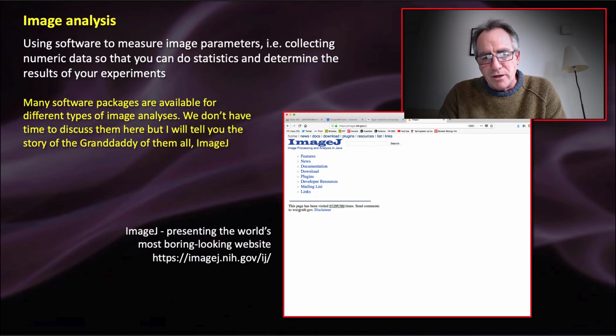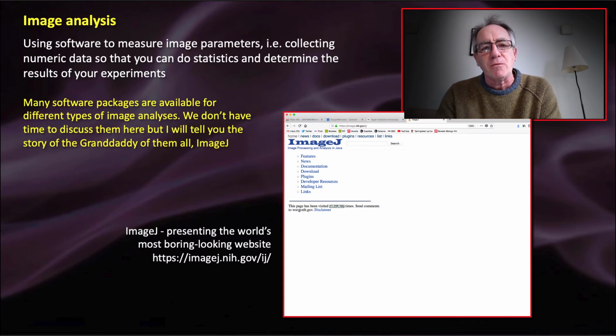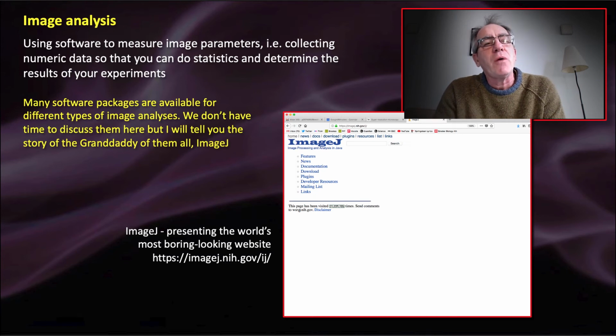The one thing that we've got to talk about when we talk about microscopy is image analysis. You can sit in your little dark room all day long making beautiful pictures. I've been showing lots of pictures of living cells. You make time series movies by repeatedly collecting images of the same plane of focus like this. So you might set up and you might say, well, I want to image this cell for 1 minute, which is how I did those FRAP experiments that I showed you earlier.